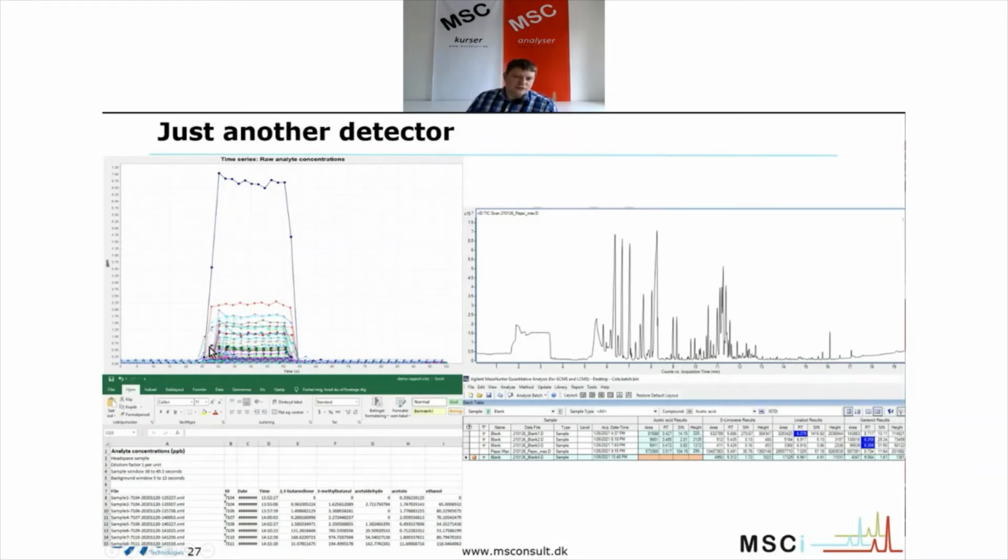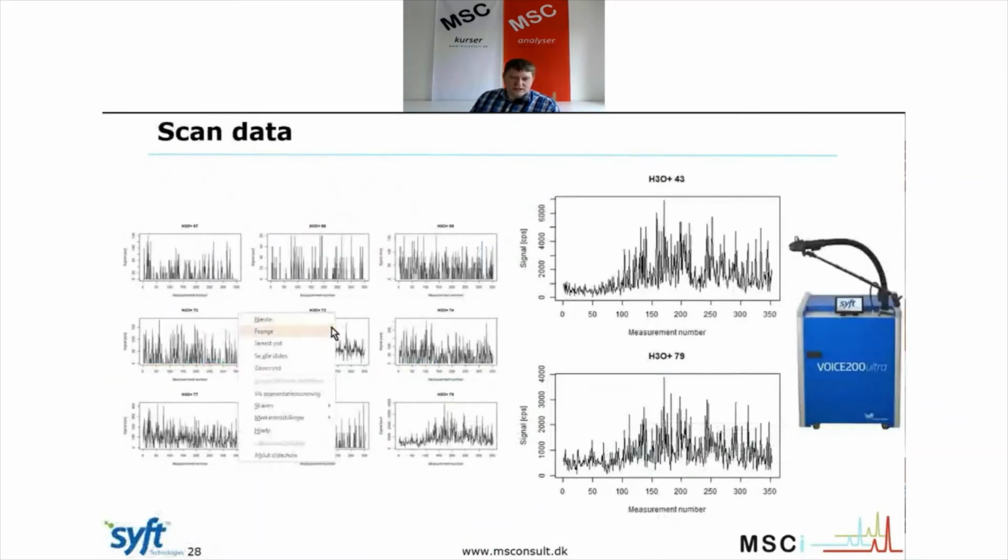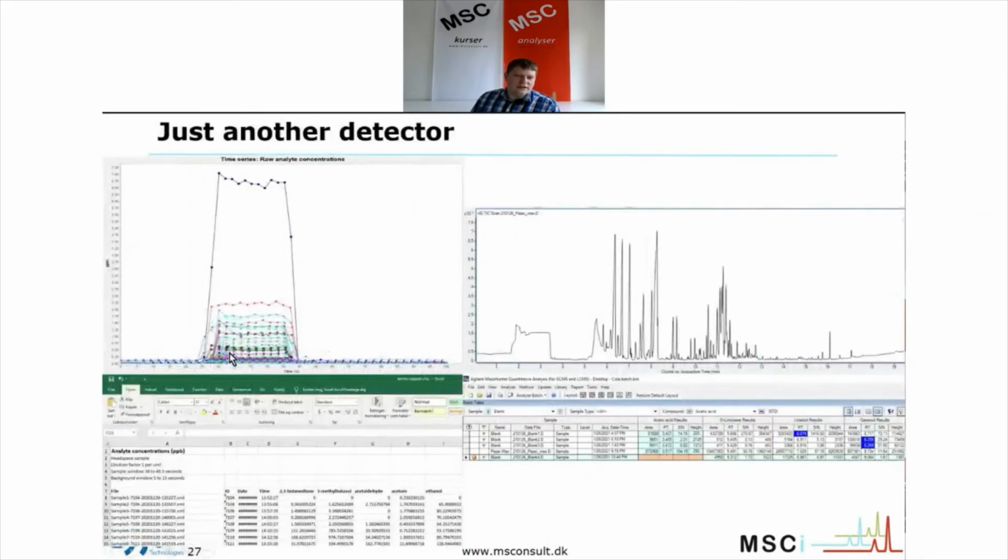In a SIFT, the Siftogram looks a bit different. You have your injection, where you can see each line is actually a compound or an ion. So if you're measuring ethanol with both H3O+, NO+, and O2+, it will be a line each. So here you have a peak equals a compound, and here you have a line equals a compound.